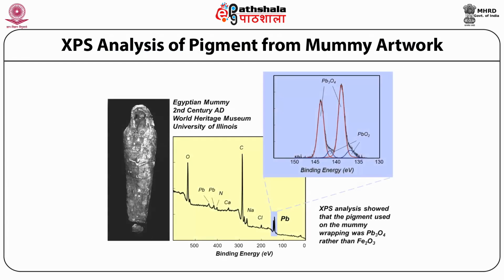And information about XPS analysis of pigment from mummy artwork. Mummies were very ancient structures or statues which are found in Egypt, and these are very old World Heritage structures.